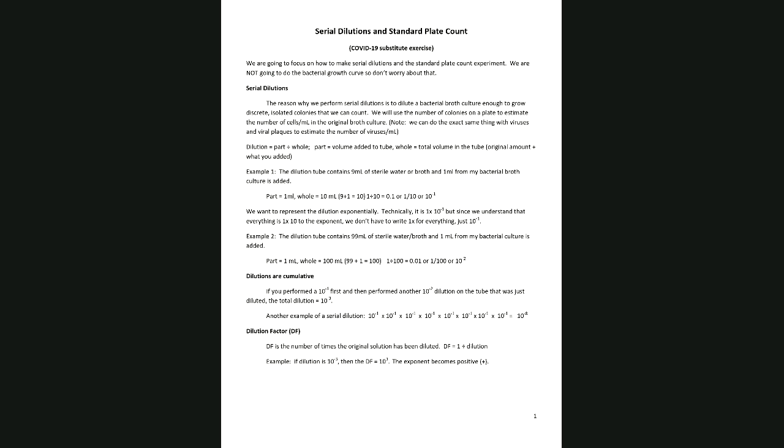So the experiment that we do is the serial dilutions and standard plate counts. There's also a part that we do that I'm not doing remotely, which involves using a spectrophotometer to measure the absorbance of a bacterial culture. I'll talk a little bit about it and we'll watch a video on how to use the spectrophotometer, but I don't actually do that remotely. So we're just going to focus on how to calculate serial dilutions and calculate the number of cells per milliliter in the original sample.